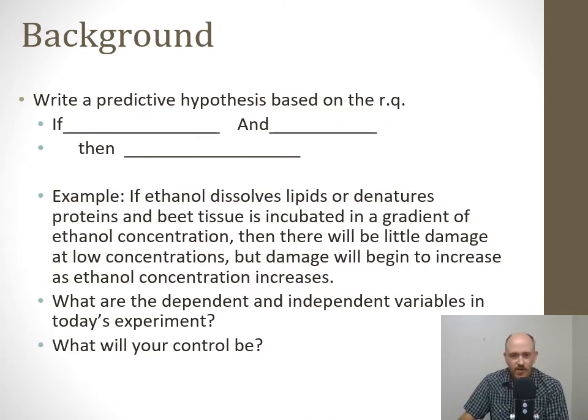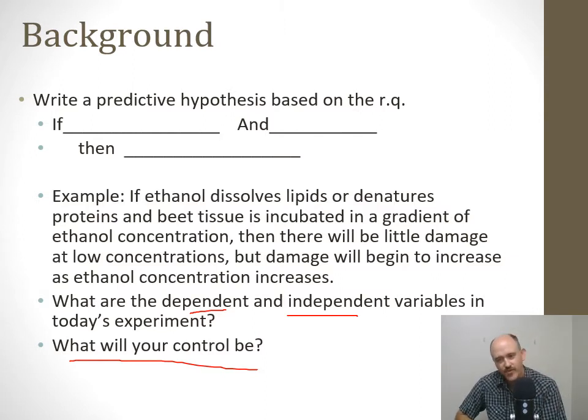So I'll ask you, what are the independent variables today? You should be able to answer that. And what would a control be? Once again, if you're testing various concentrations of ethanol, what would the control be?